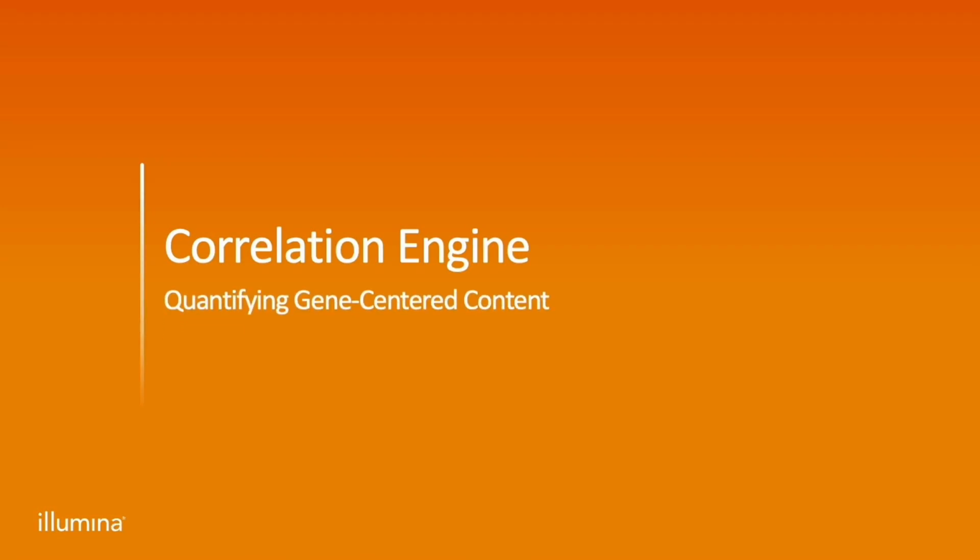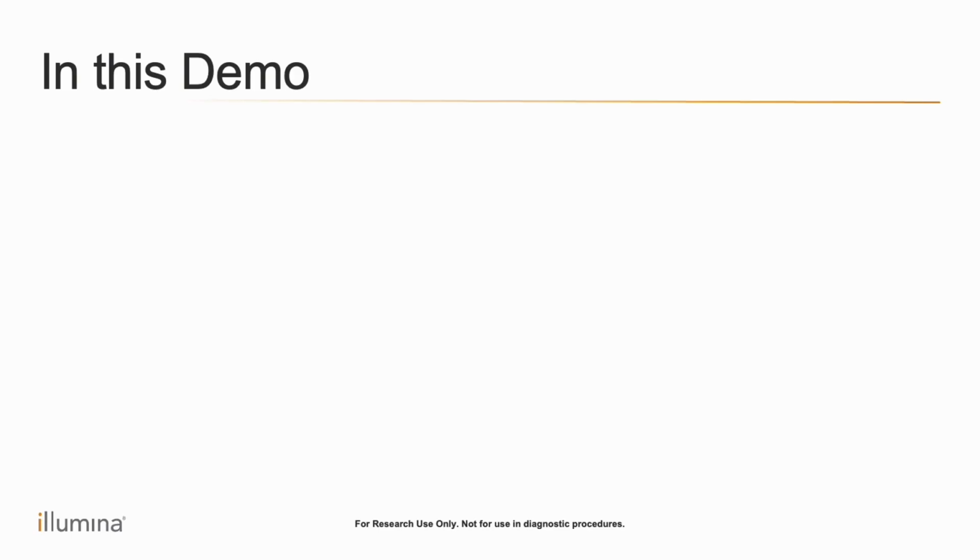Quantifying gene-centered content in Illumina's Correlation Engine. In this demo, we'll briefly examine ways to use Correlation Engine to interpret RNA-seq and other data types.